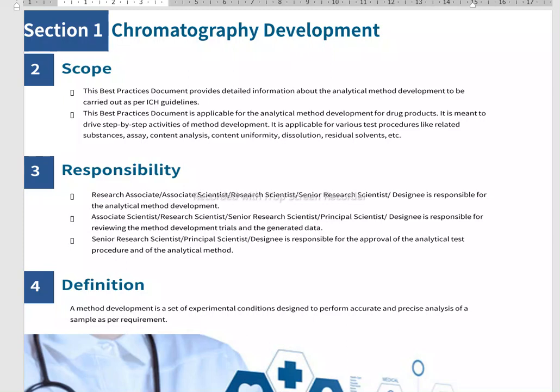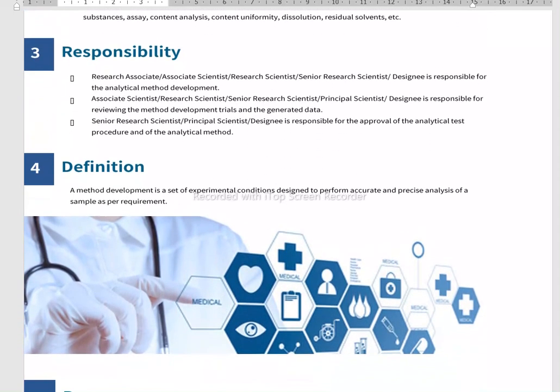Okay friends, whatever we talk about in this video is applicable for both drug product and drug substances. Who is responsible for the development of the chromatographic procedure for liquid chromatography? Research associate, associate scientist, research scientist, senior research scientist, or designee is responsible for the analytical method development. Associate scientist, research scientist, senior research scientist, principal scientist, or designee is responsible for reviewing the analytical method development trial and the generated data. Senior research scientist, principal scientist, or designee is responsible for the approval of the analytical test procedure and analytical method.